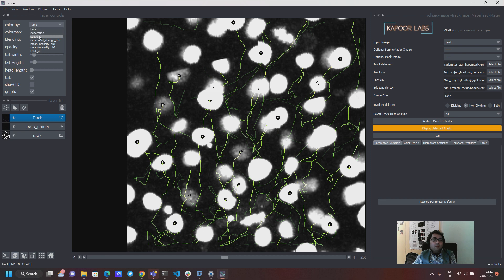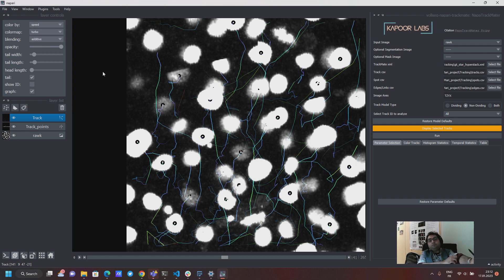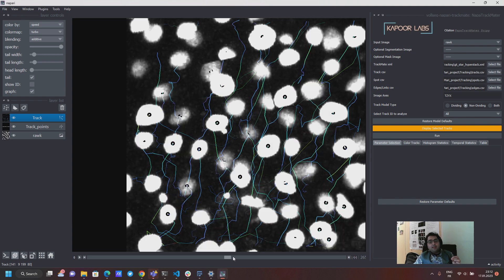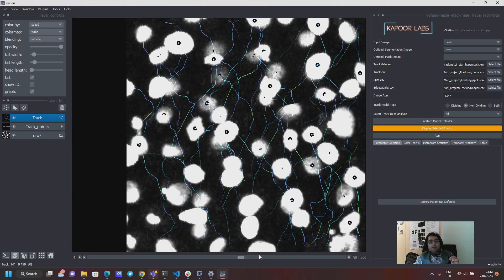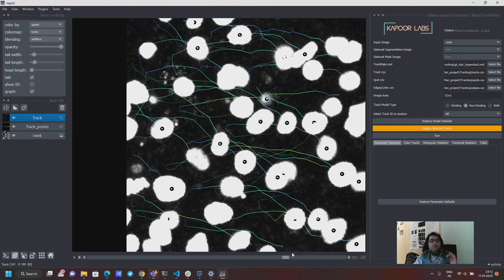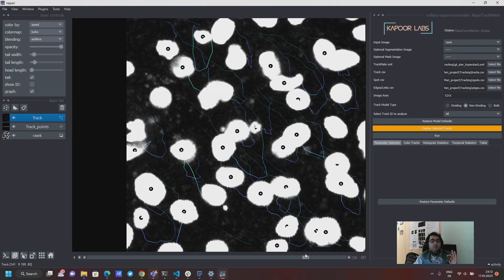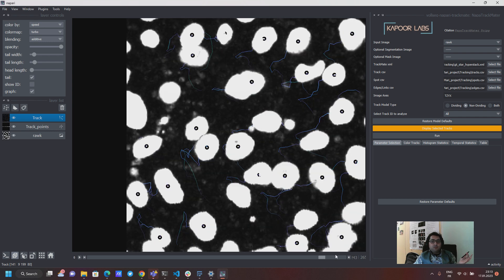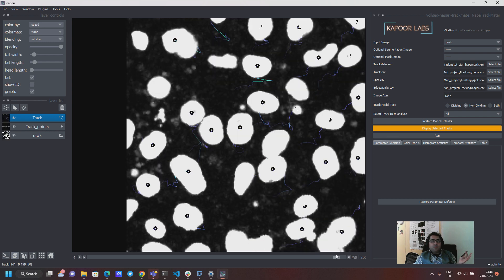And then you can visualize them with speed. So speed is a property which is attached to each of these cells and now you can color the track with the speed of the cell at that particular time. So it's kind of a very visual way of getting information quickly.